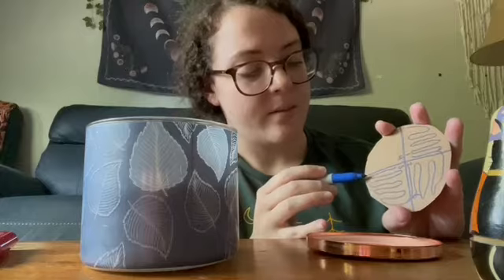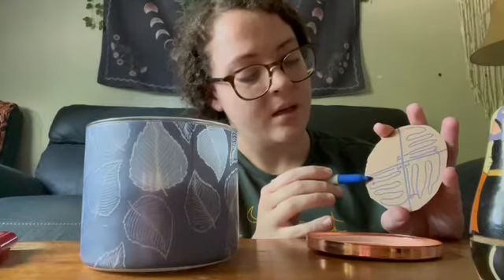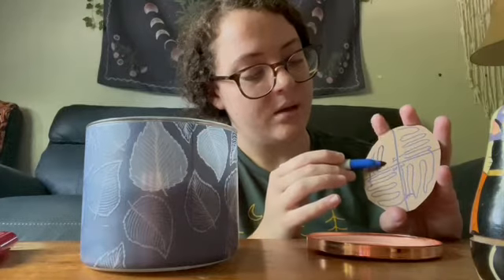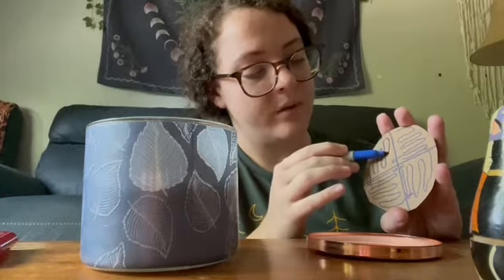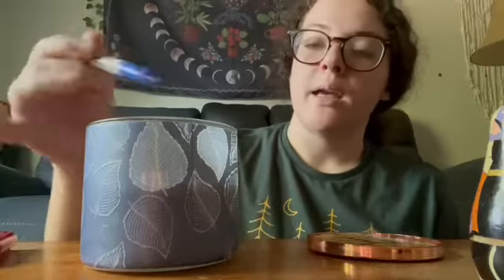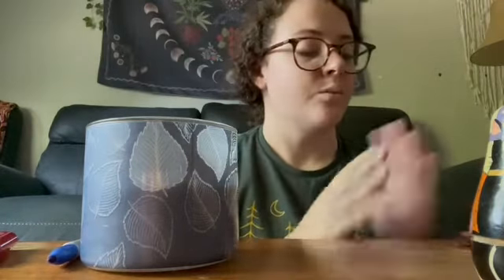Next you pick up your agar plate again, turn it another 90 degrees, swipe one or two times through quadrant three and bring it into quadrant four doing the same swipes, not overlapping or going into any other quadrants. Then put it back down upside down to prevent moisture from getting in, flame your inoculating loop again, and then incubate your petri dish to promote bacterial growth.